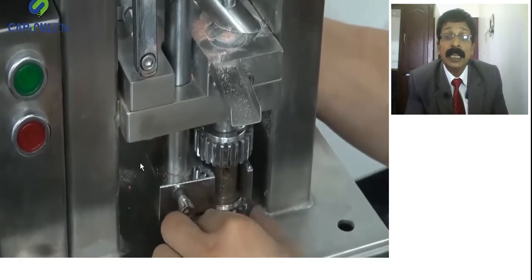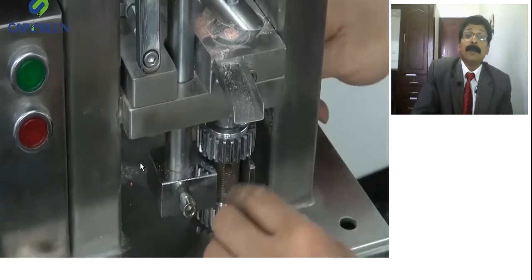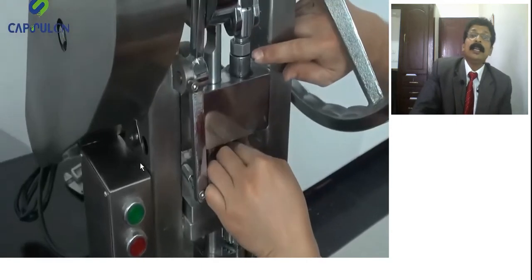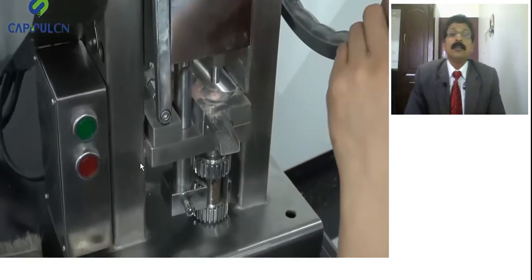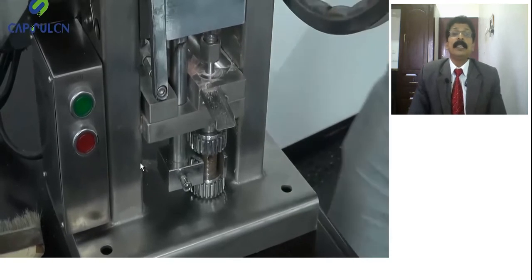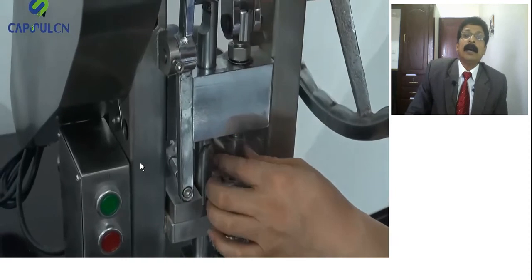He wants to make a thinner tablet, and he knows how many millimeters it will come to. So the capacity is adjusted by that screw, and the hardness is adjusted by the upper punch. Both are adjusted 2-3 times until he finds what is necessary. Now again with manual rotating he gets the tablets.